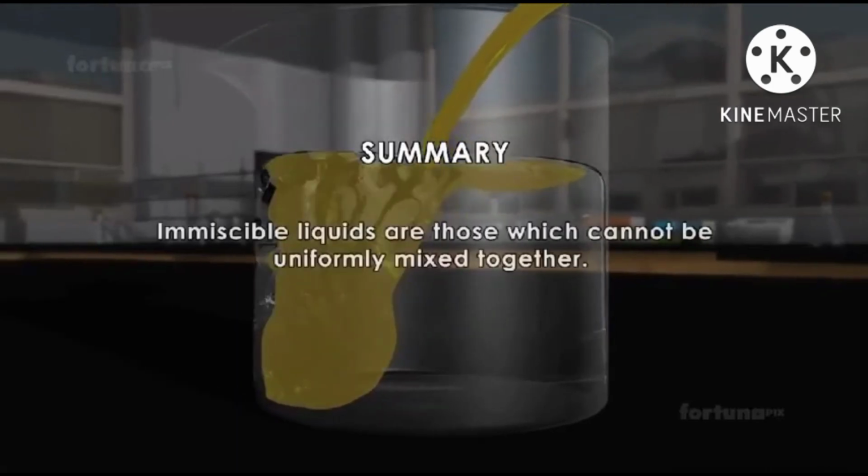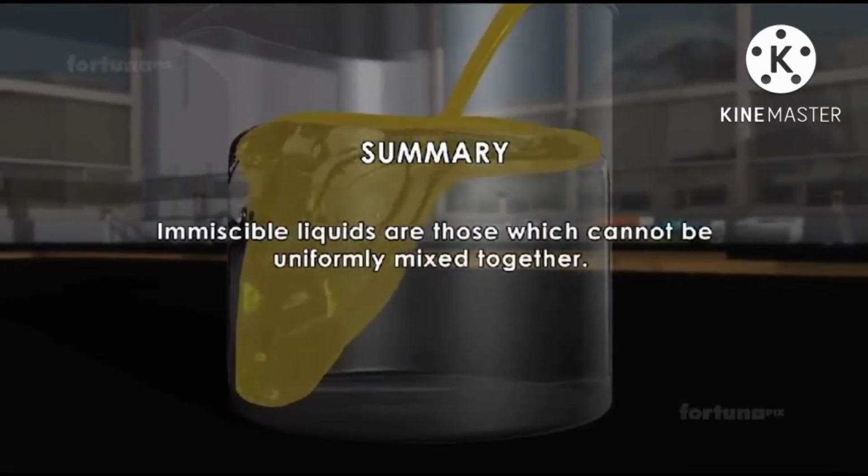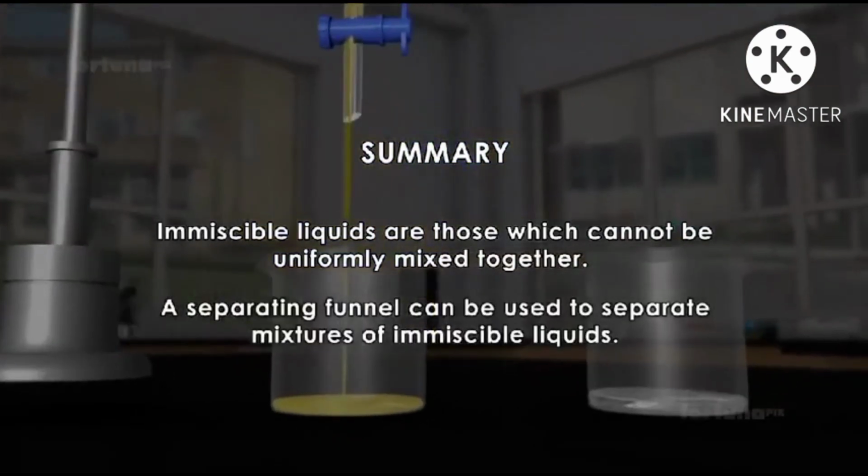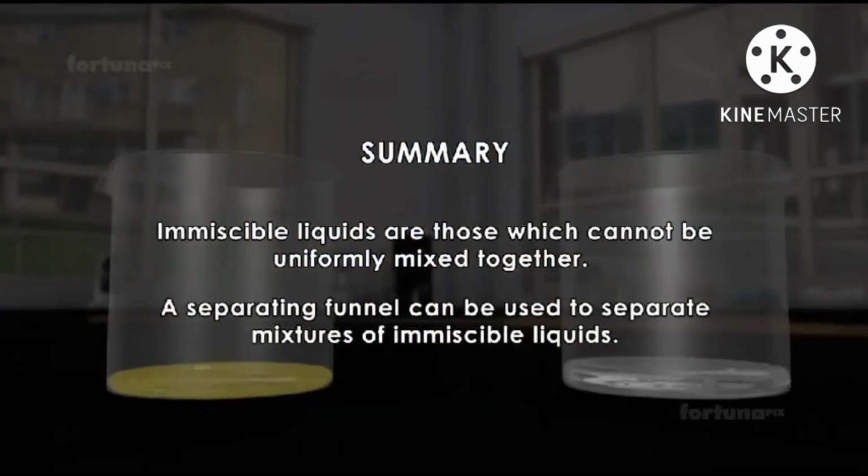Summary: immiscible liquids are those which cannot be uniformly mixed together. A separating funnel can be used to separate mixtures of immiscible liquids.